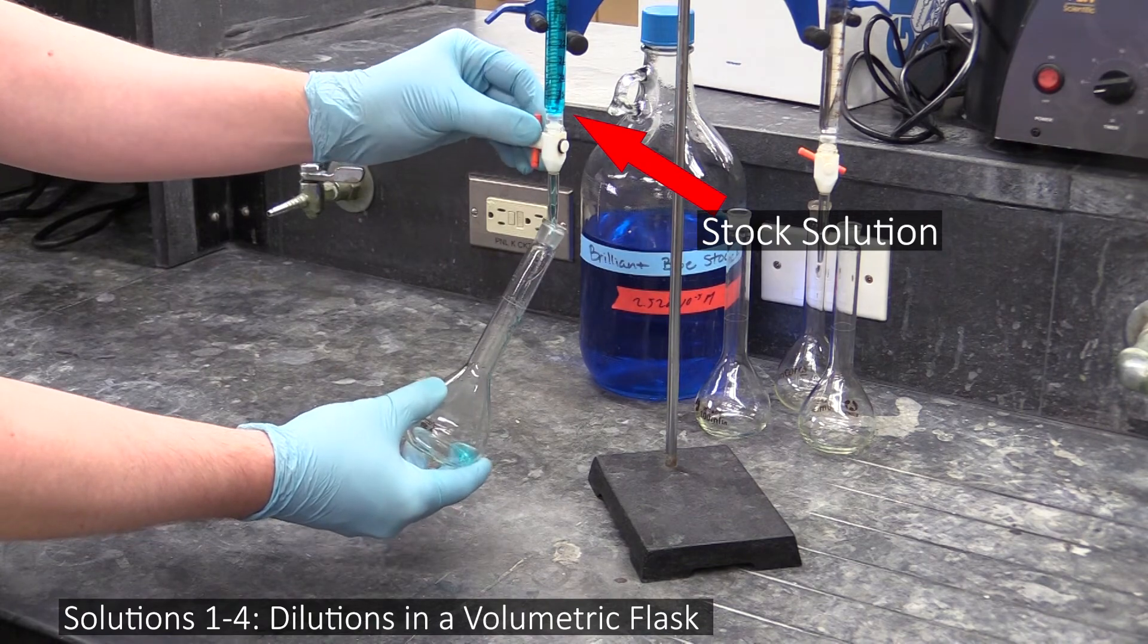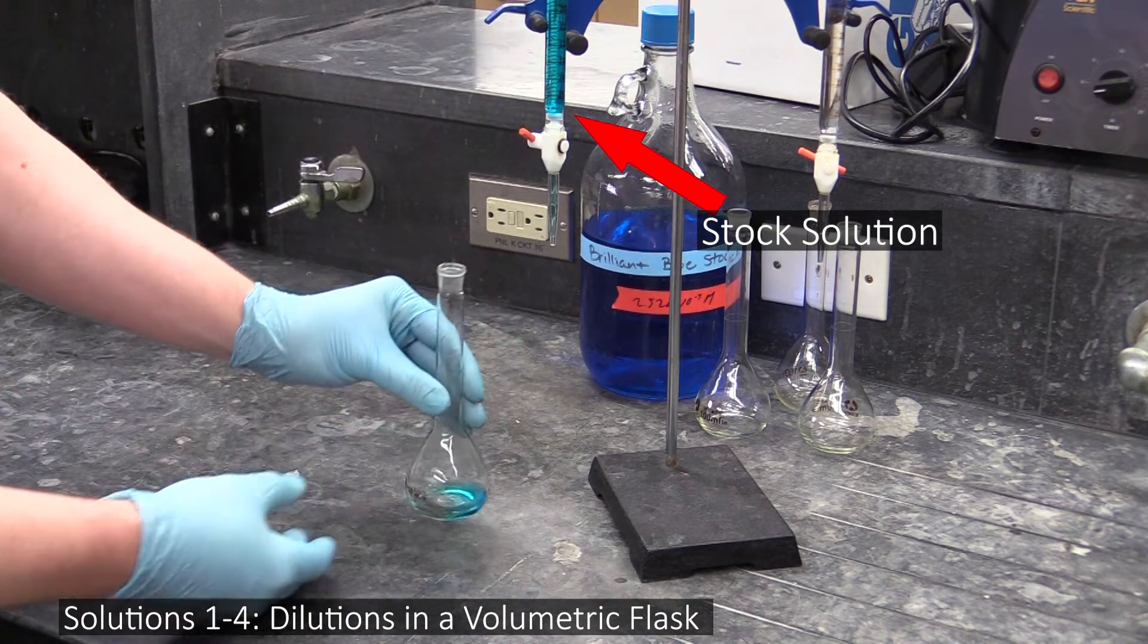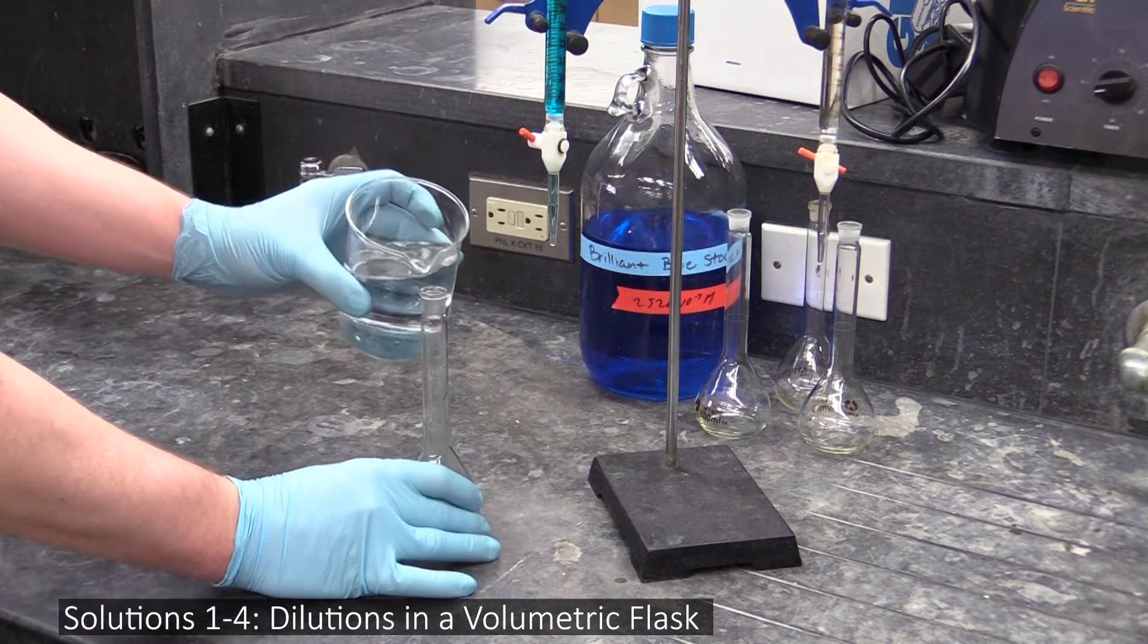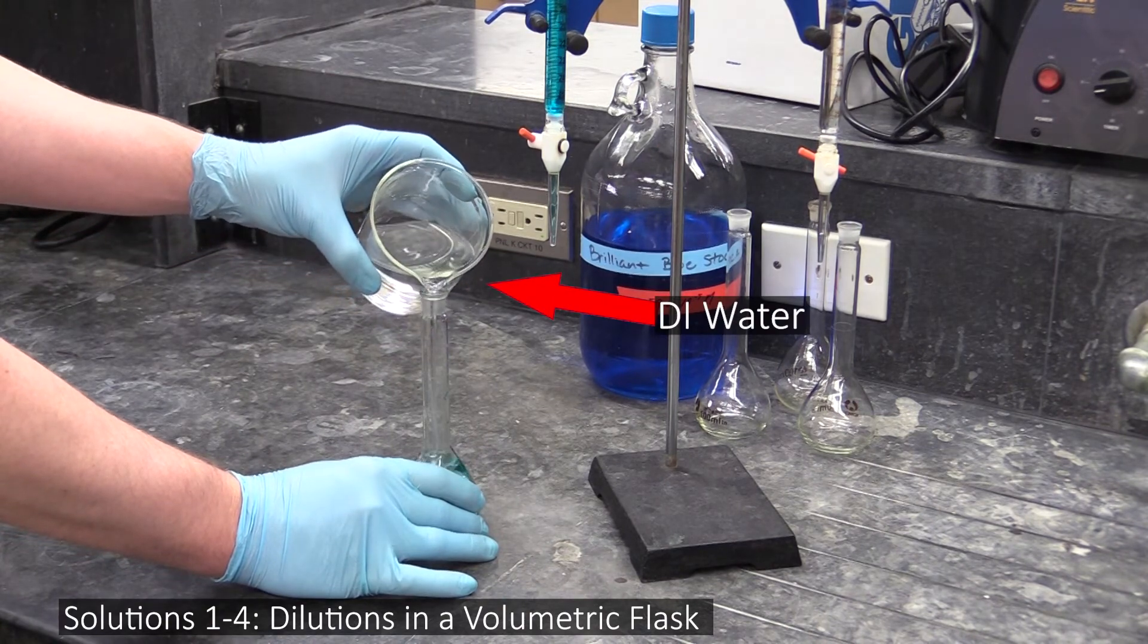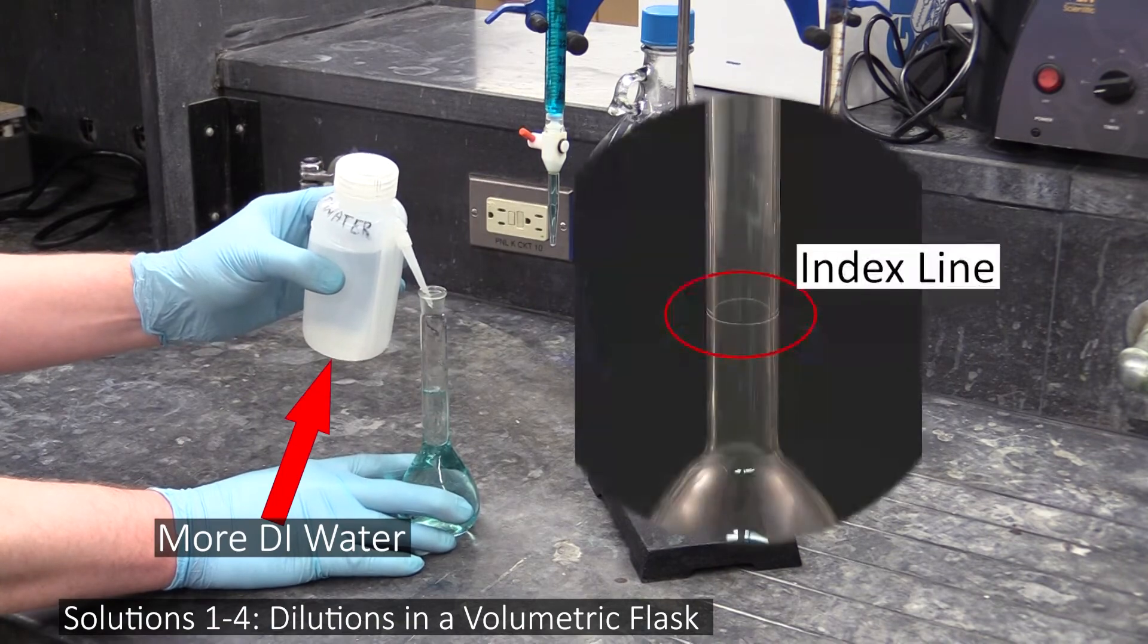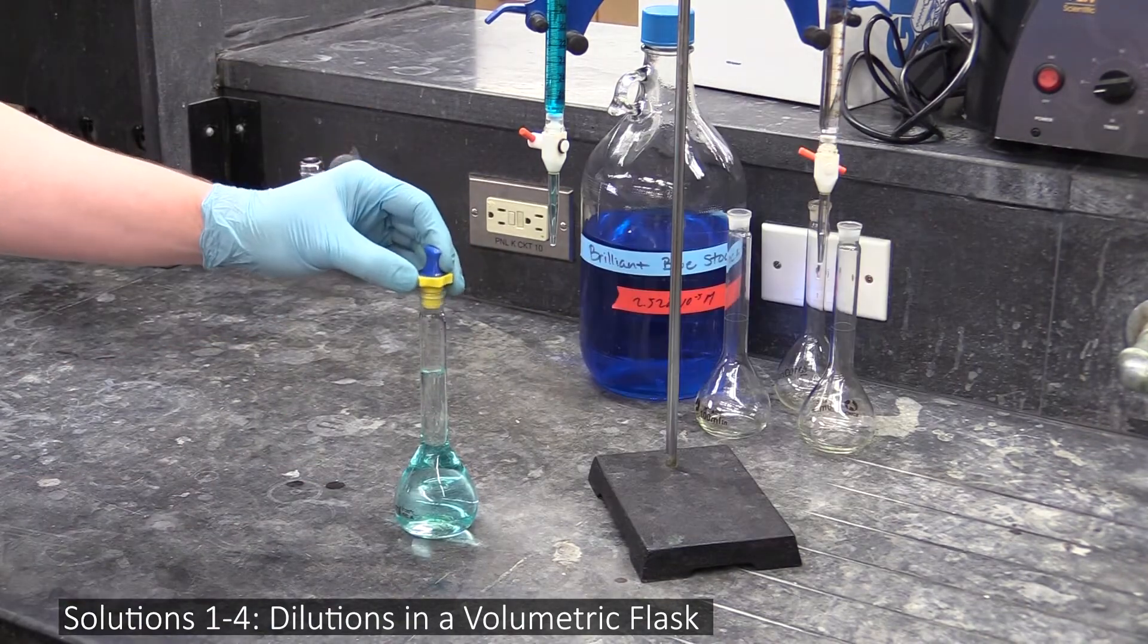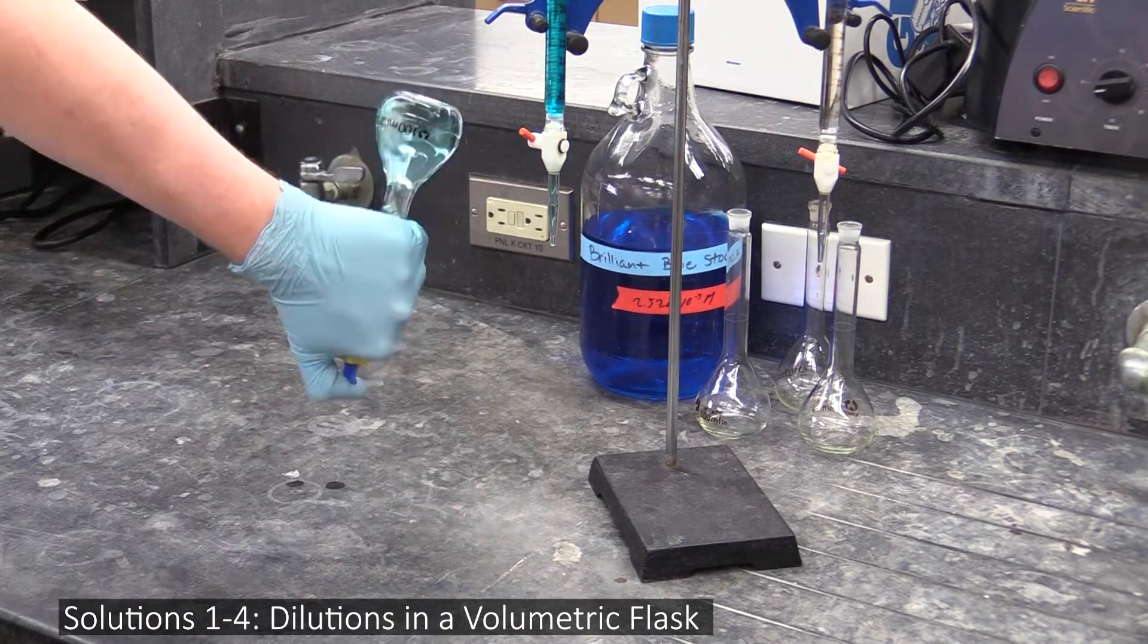Now, to make your first four solutions, you'll use a burette to add various quantities of stock to volumetric flasks, and then bring these solutions up to the flask's rated volume with DI water. Just be careful not to go past the flask's index line when filling them, and make sure to mix them thoroughly by inverting 20-30 times.